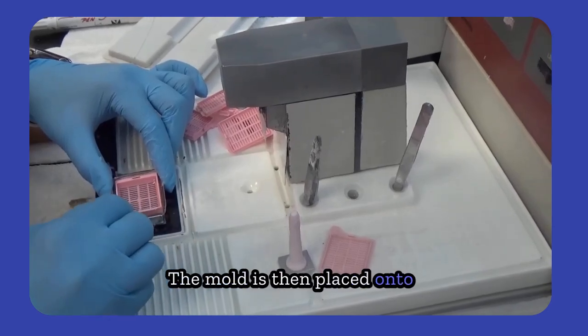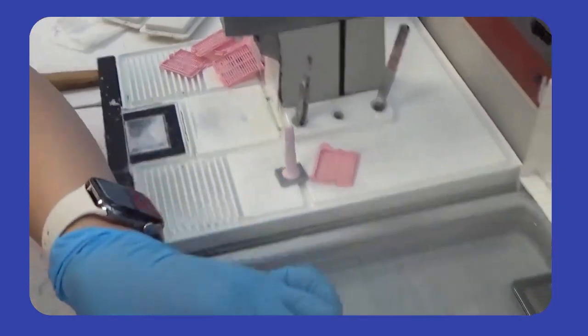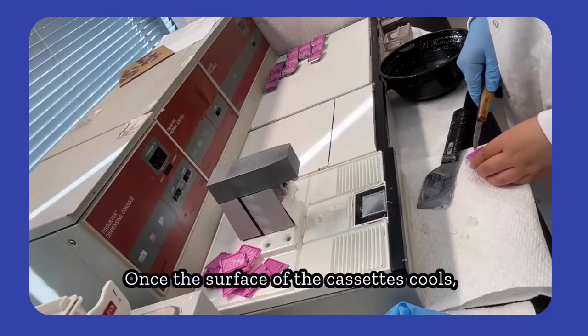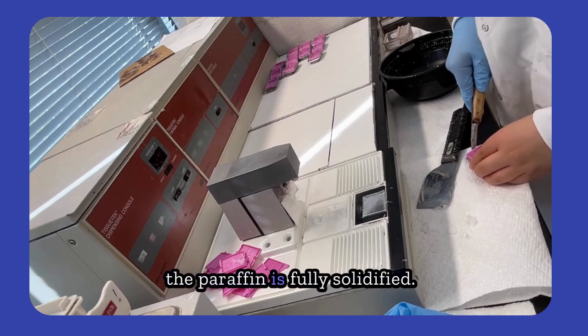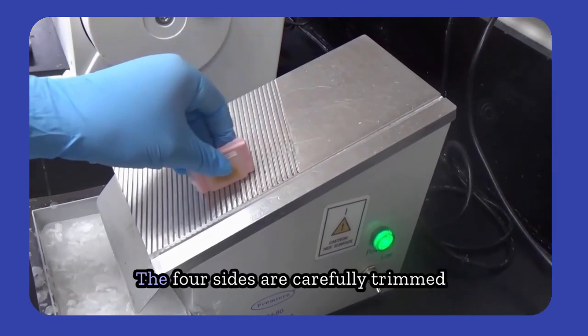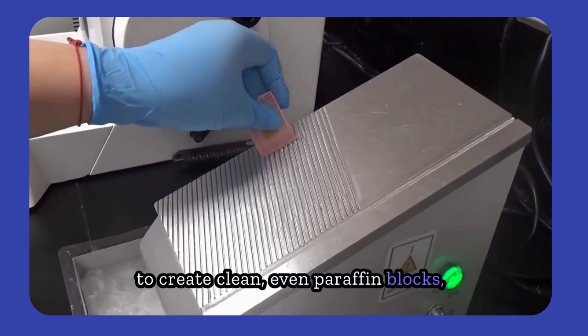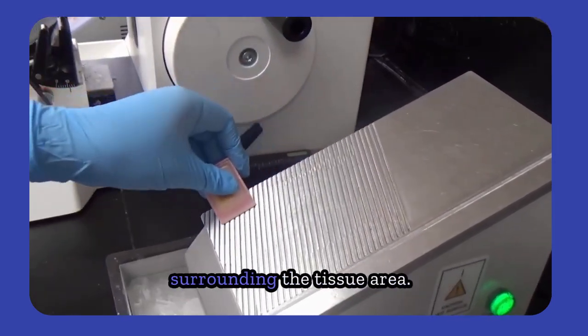The mold is then placed onto a cooling surface to allow the paraffin to solidify completely. Once the surface of the cassettes cools and the paraffin is fully solidified, the blocks are removed from the metal cassettes. The four sides are carefully trimmed to create clean, even paraffin blocks, taking care not to melt the paraffin surrounding the tissue area.